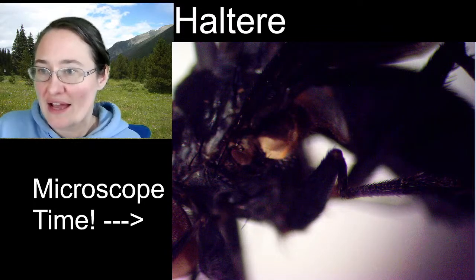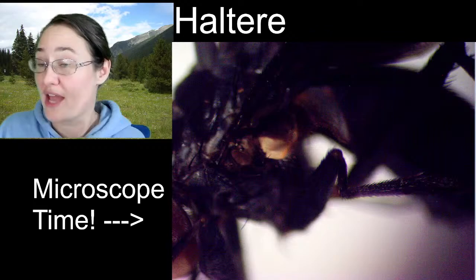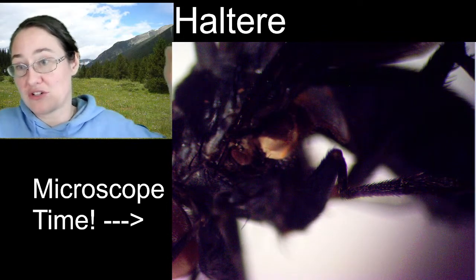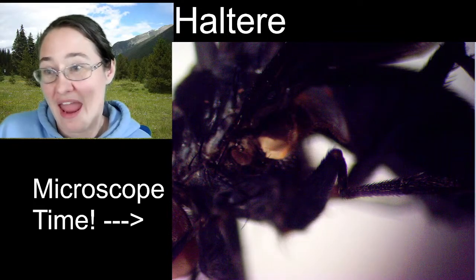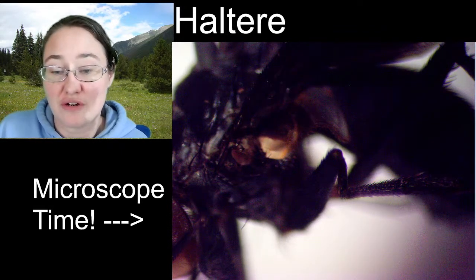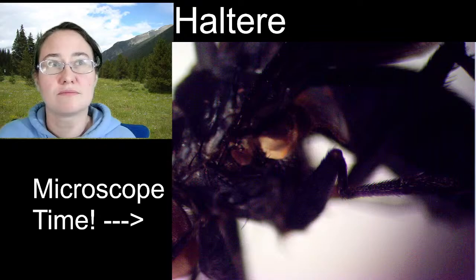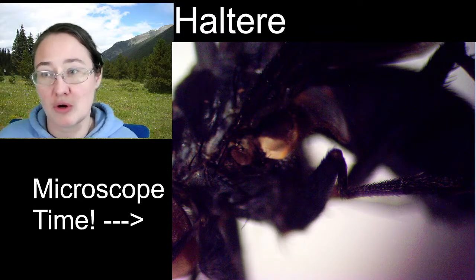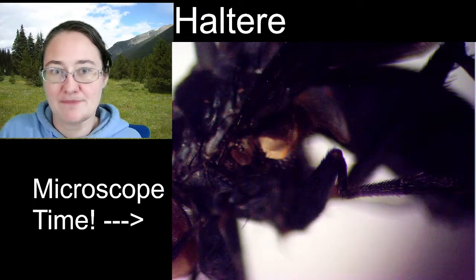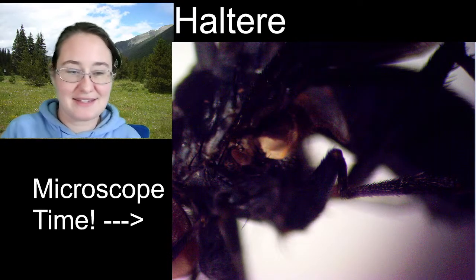The halter is a fly's adaptation from the hind wing. Flies only have two wings, so they only have a front pair of wings. And in replacement of the hind wing, they have halteres. What those are essentially are fly gyroscopes. They help them balance in the air, make sure that they stay steady, and it's why flies are such good flyers. Also, evolutionarily, flies are the newest order. So they are like the most adapted. Evolutionarily, they came around last. Ah, good legs! Yes, very, very much so.